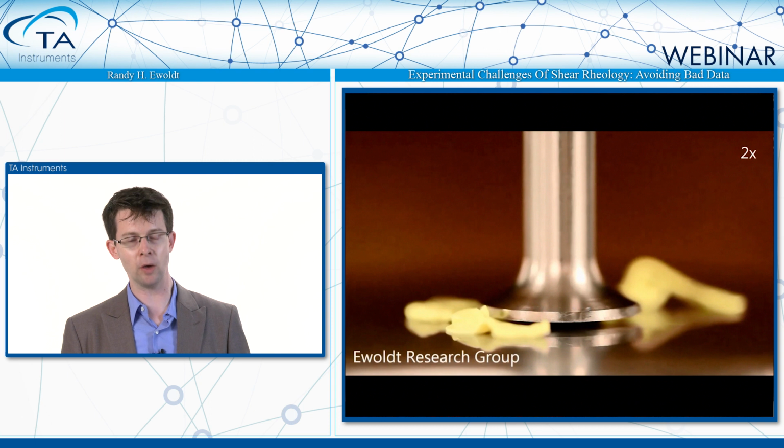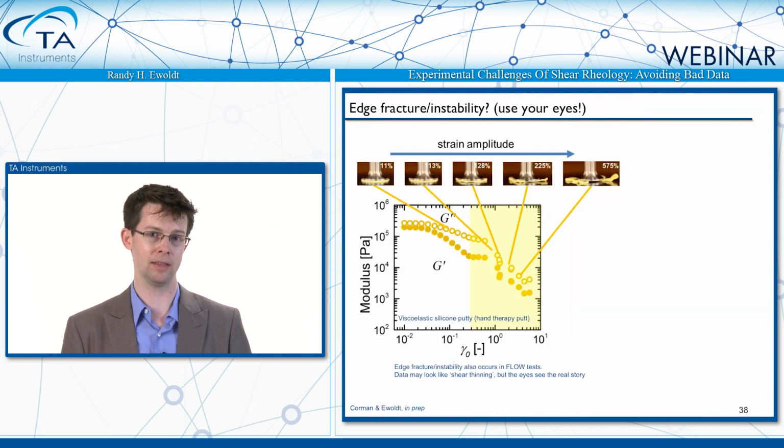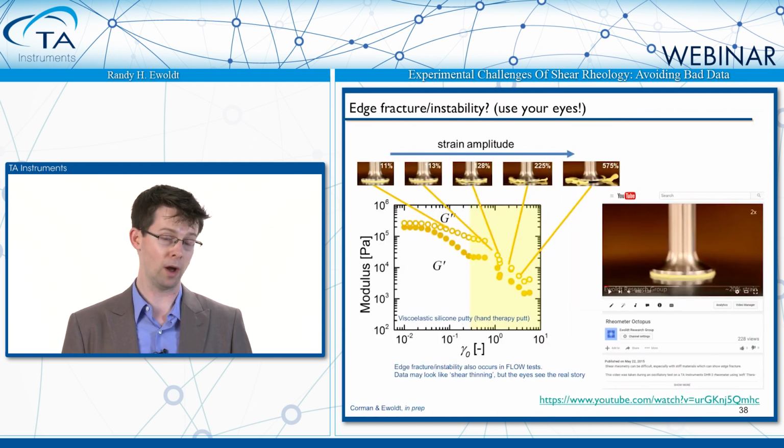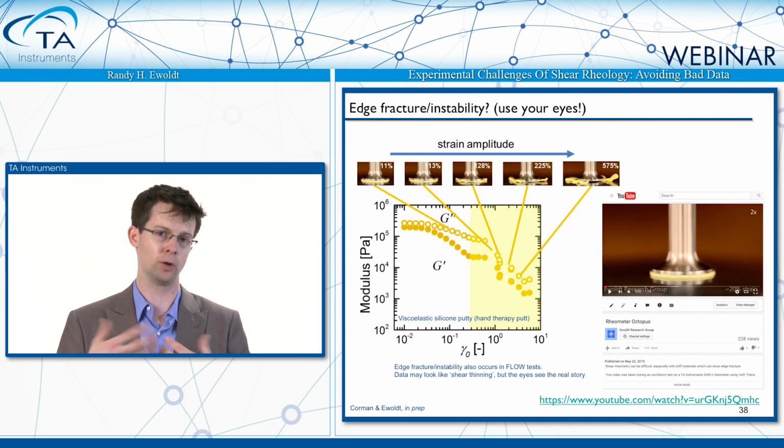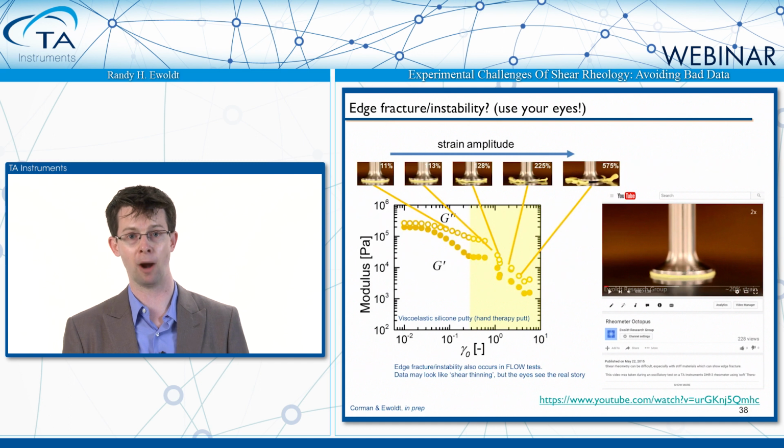So what ideas might you have for proving and convincing somebody that the data is actually real? Well, you could make this measurement at 2 different gaps and show exactly where the data overlie each other, whatever data that you care about seeing, be it the first harmonics or maybe the raw oscillatory waveforms. You're going to want the stresses and strains to be exactly the same or within your tolerance for error at 2 different gaps to really believe that you're measuring intrinsic properties.